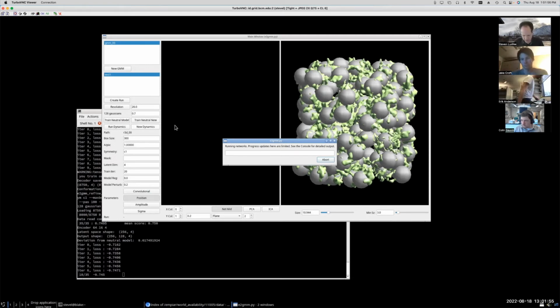Okay, this is running pretty fast. This is the advantage of the fact that I chose a very coarse resolution and a small number of Gaussians. It'll take longer to run, obviously, if you give it 1,000 Gaussians or something to use.